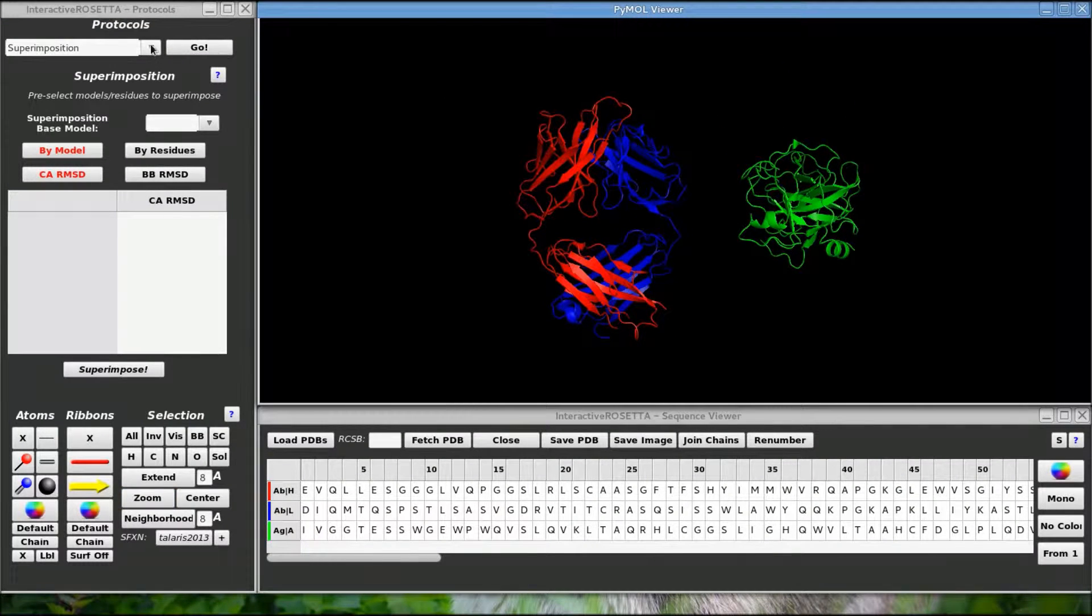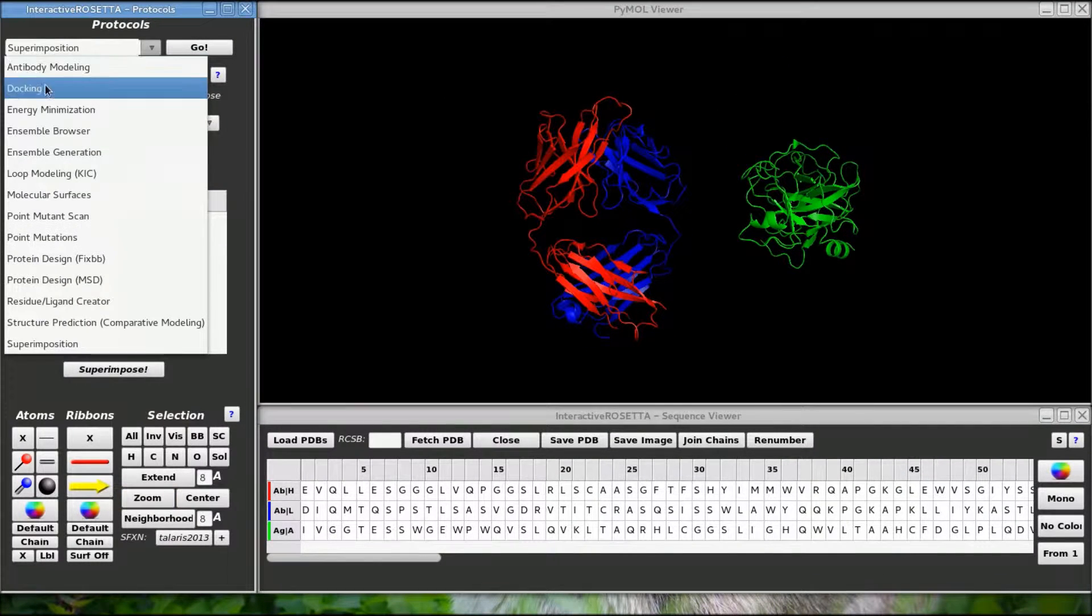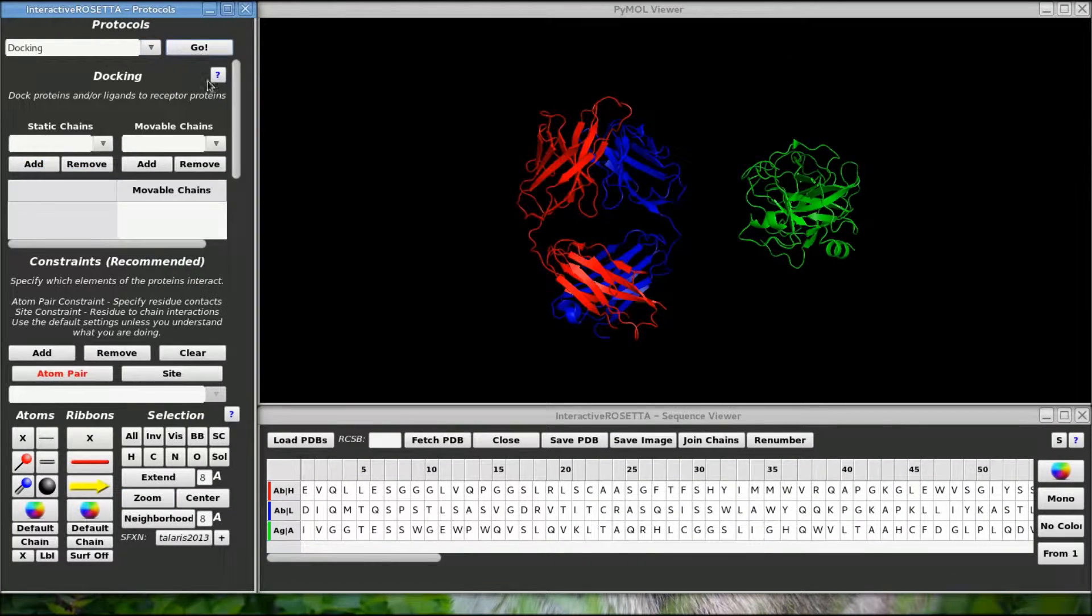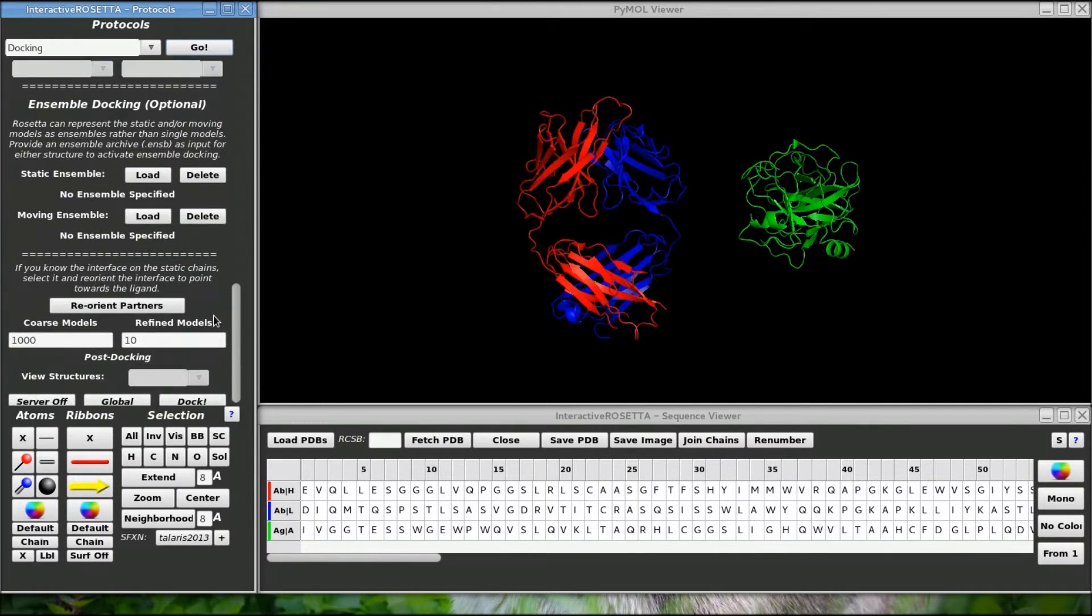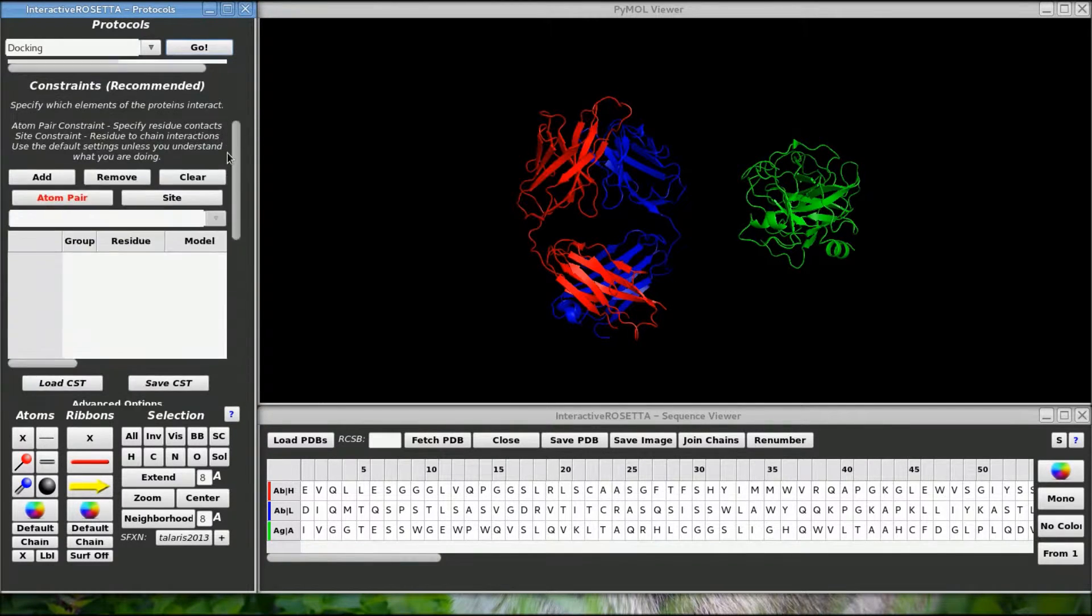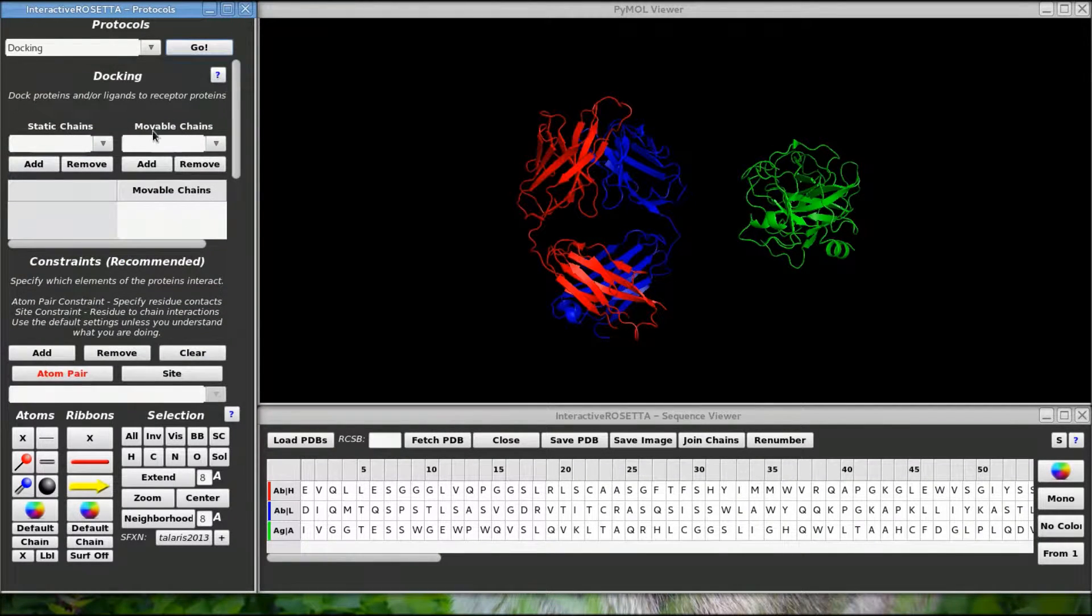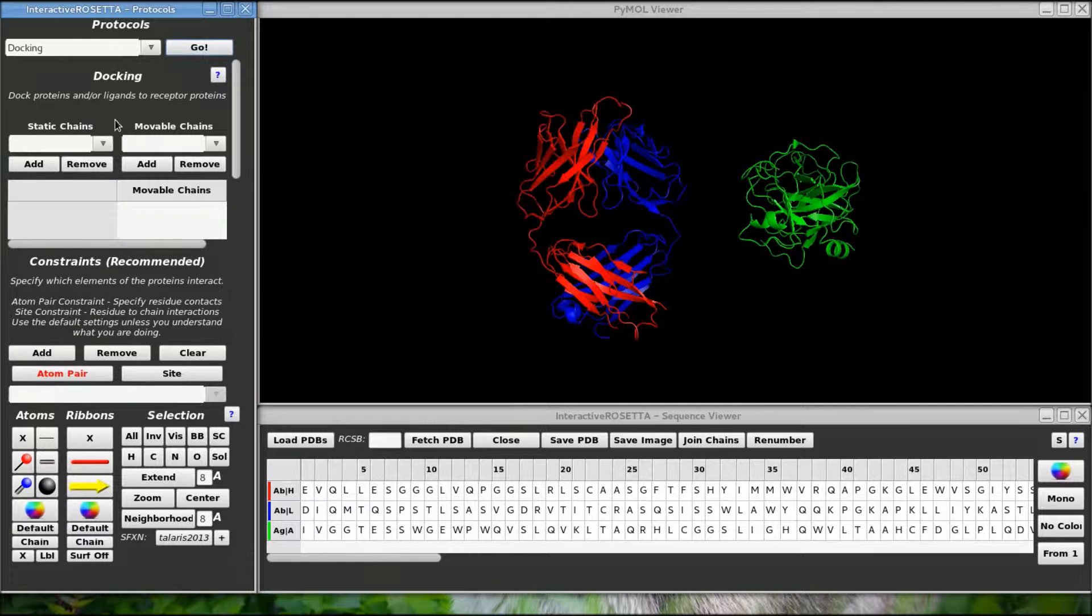let's go over to the protocols menu and select docking. This is what the docking panel looks like. There are a lot of controls here and they are all important, so let's go over them one by one.